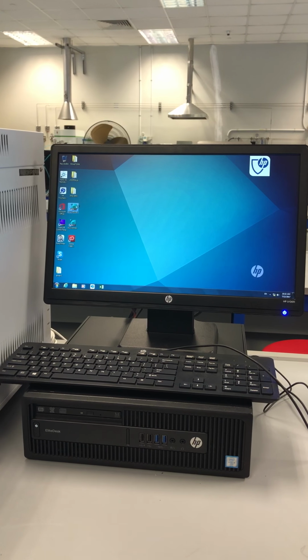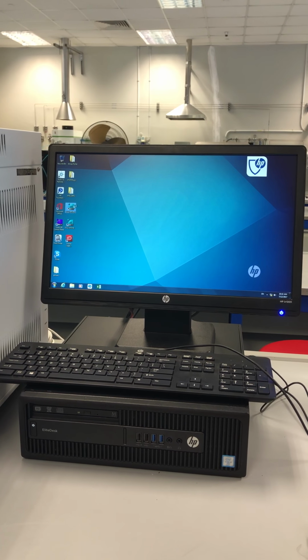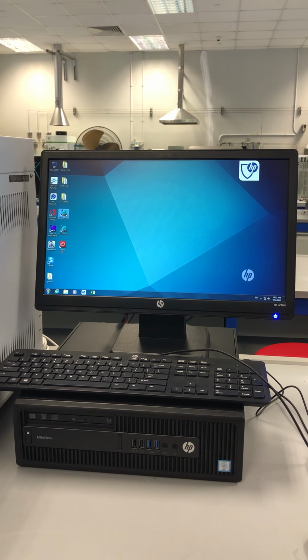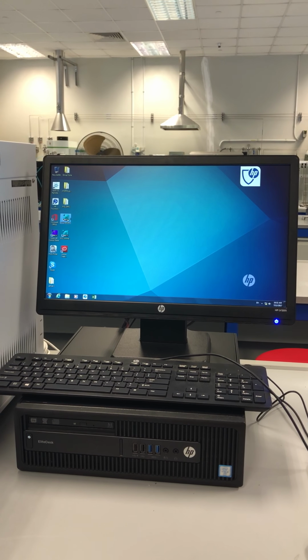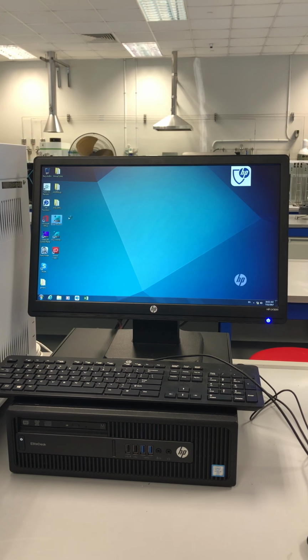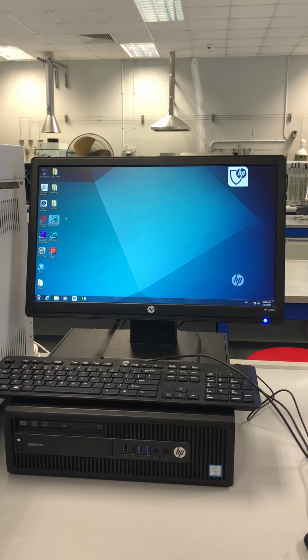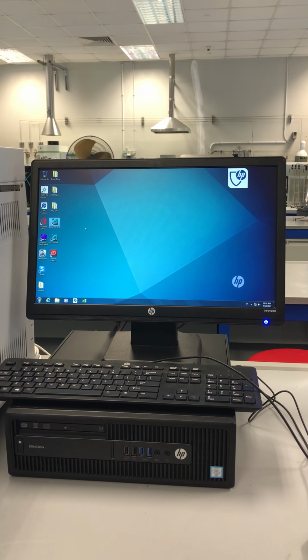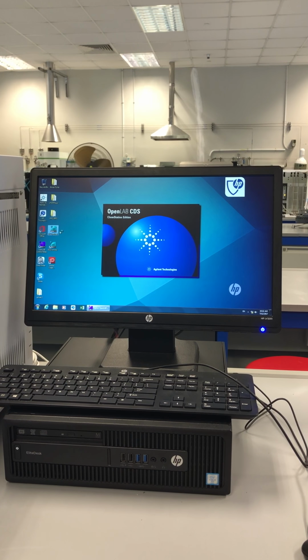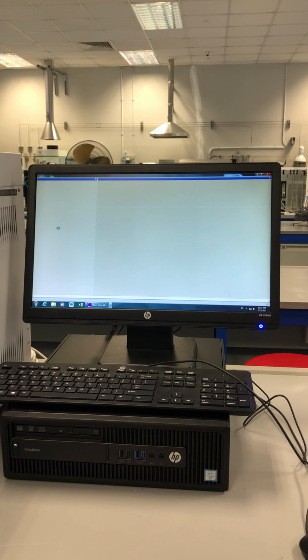Instrument, right? So we will select GC offline instead. Okay, we will do our post run for your analysis from last lesson. Double click on the offline. Wait for them. It's good.